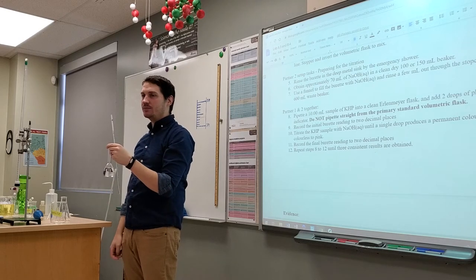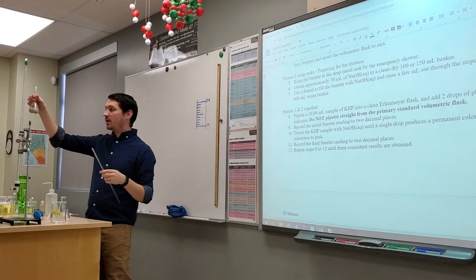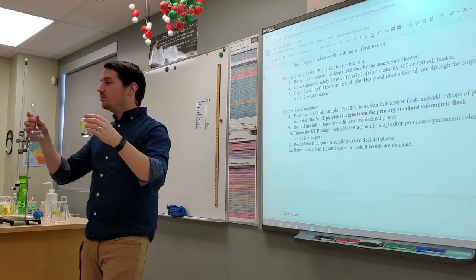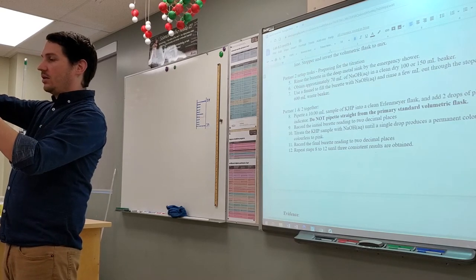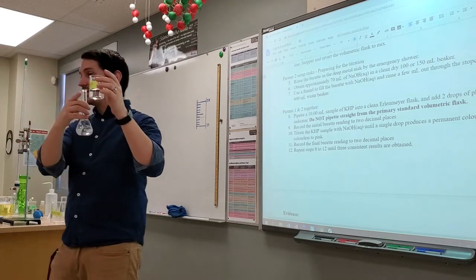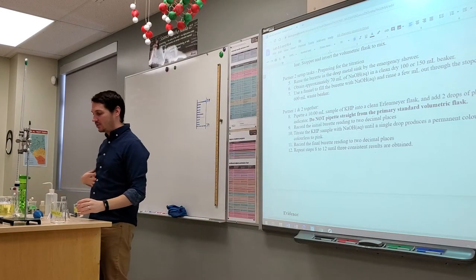Shoot, so what should I do? Redo it. Well, yeah, if you do that. But what should I do to avoid that? Instead of pipetting out of here, what could I do? Put it into a smaller beaker. I can just take a tiny 50 mil beaker or 100 mil beaker, right? I'll take my KHP, dump a bunch in there. And we've got extras, just in case we screw this group up, we still have extras that are totally untouched and unsullied, okay?